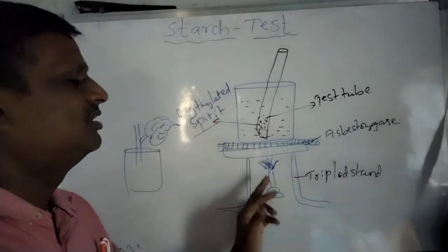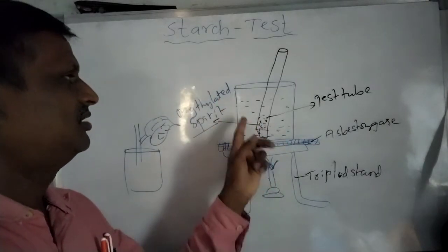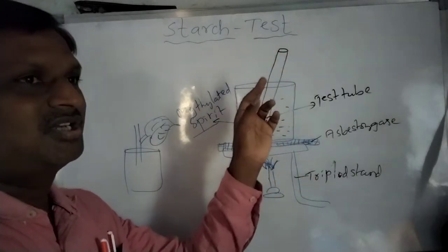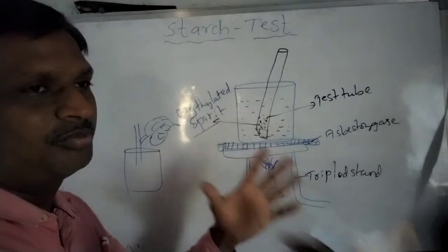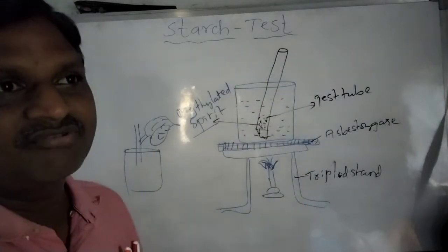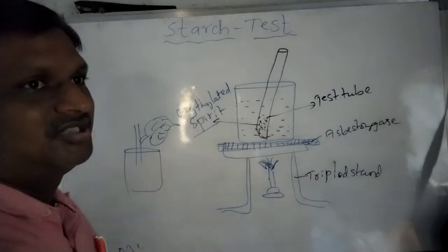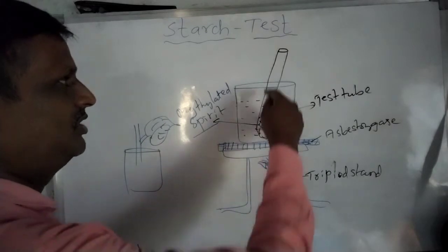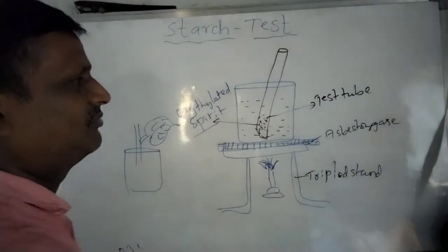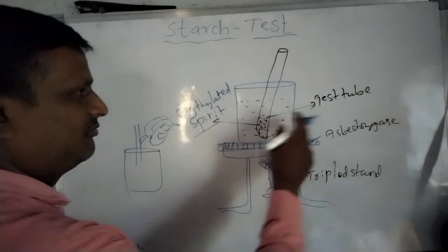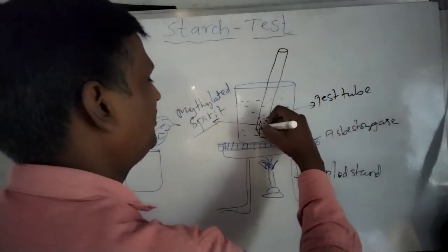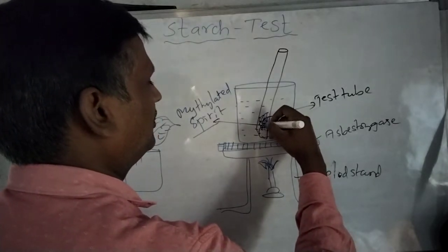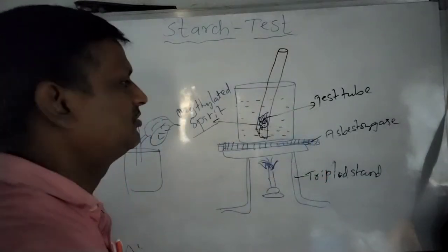If the methylated spirit is boiled directly on the Bunsen burner, the fumes coming out of the test tube could catch fire and the whole setup could burn. That is why we take this precaution — the test tube containing methylated spirit is kept inside the beaker of water. The boiled leaf is then introduced into the methylated spirit.